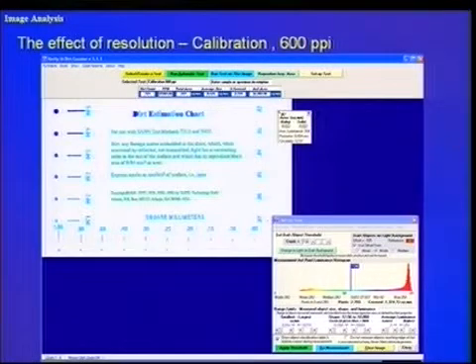But remember, the card is idealized. It's perfectly white, and the speck is standing right out on the surface. If we do this, we can get a very good measurement of the dot. This means that the scanner is working well. Everything is tuned up very nicely.